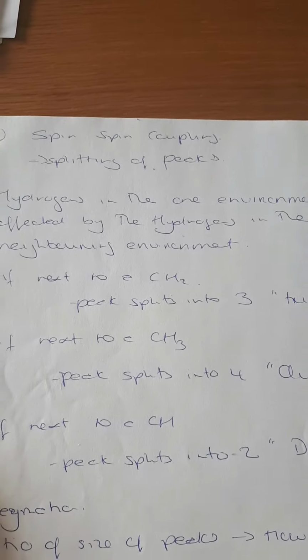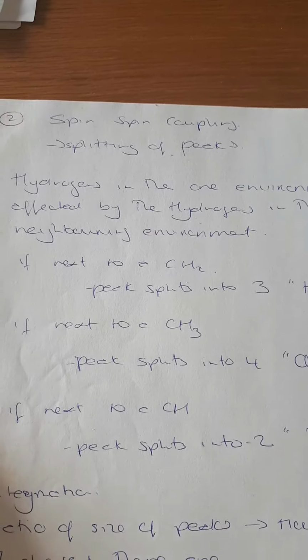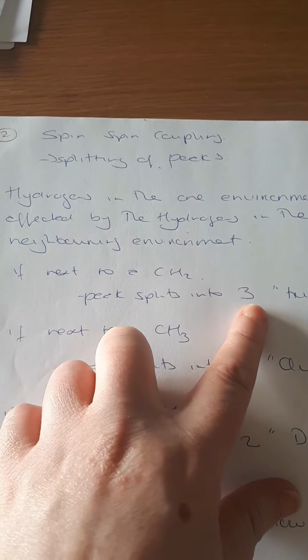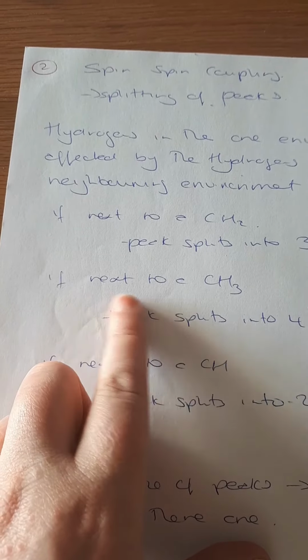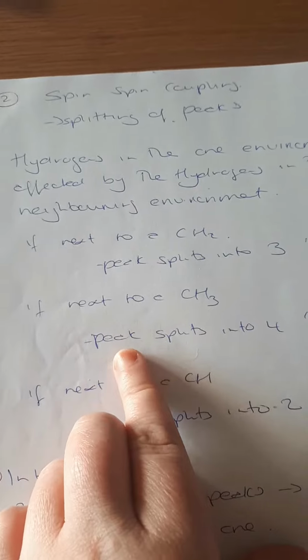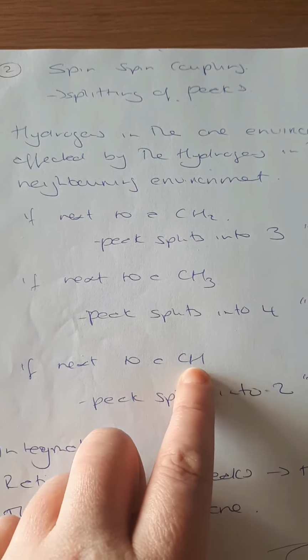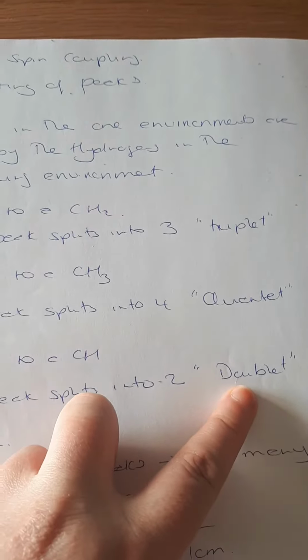So if we look then at what I've written here, hydrogens in the one environment are affected by hydrogens in the neighbouring environment. So if you're next to a CH2, so 2, the peak splits into 3. So 2 plus 1, 3. So we refer to that as a triplet. If your hydrogens are next to a CH3, that peak splits into 4. 3 plus 1, 4. That's referred to as a quartet. If it's next to a CH, well, that's only 1, the peak splits into 2, because 1 plus 1 equals 2, and that's called a doublet.